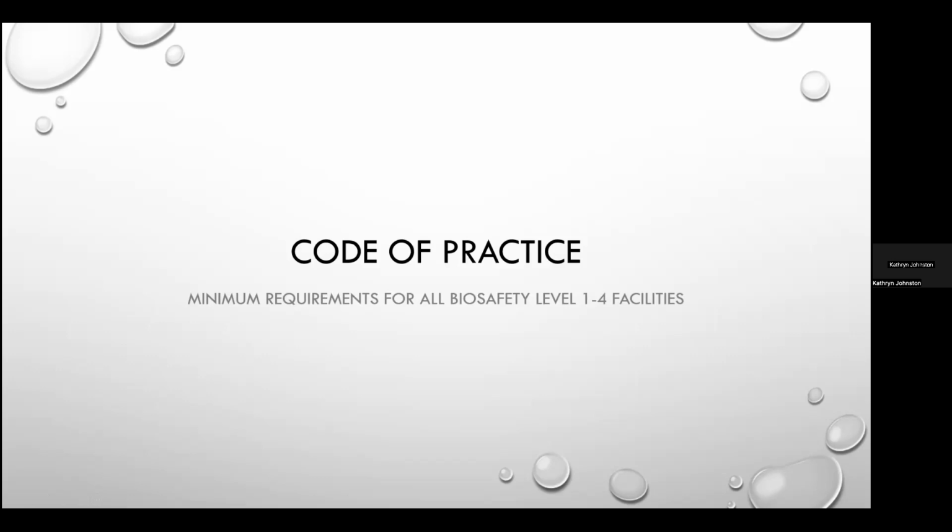The guidelines for biosafety levels 3 and 4 are actually modifications of these that I'm going to present. Since I'm not going to be discussing levels 3 or 4, I'm going to list the codes, but I'm going to focus on those that are associated with infection prevention and within that context, only up to biosafety level 2.